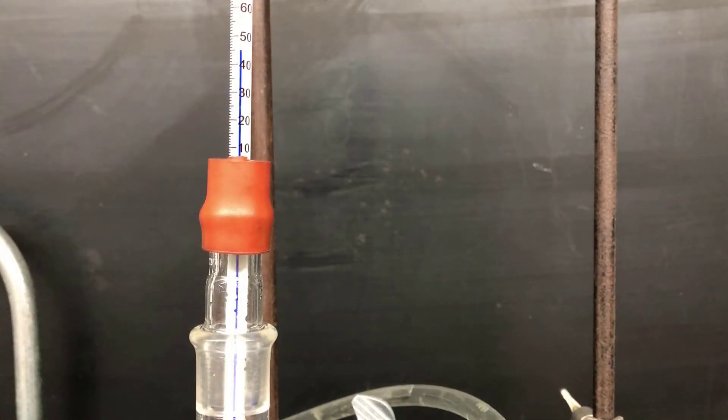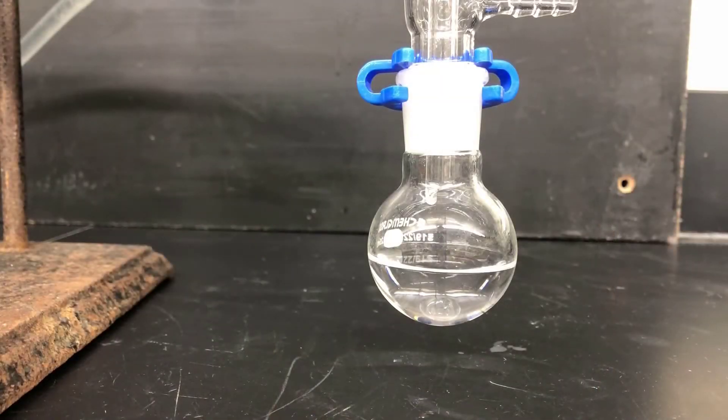Keep an eye on the temperature during the distillation. Here you can see it's around 45 degrees C. Propanal is known to boil around 47 to 49, so this is pretty close. The impurities in the propanal are all going to be higher boiling, so just collect the lowest boiling fraction — the distillation will slow down and stop on its own before the higher molecular weight impurities start coming over.